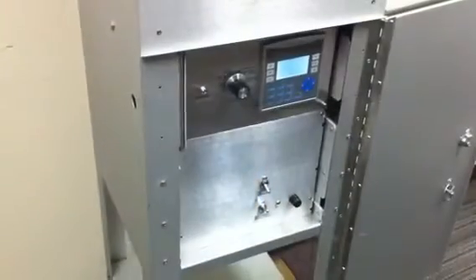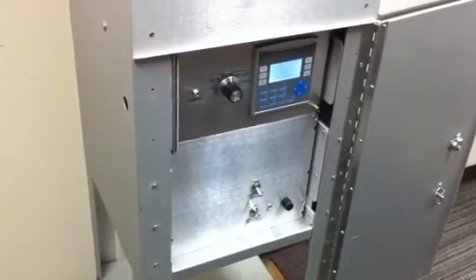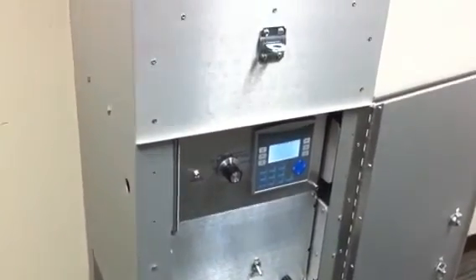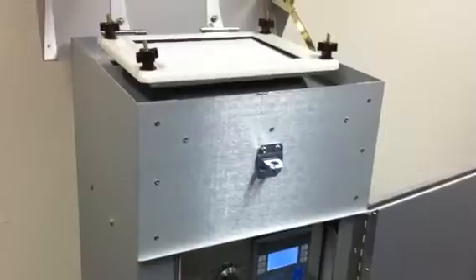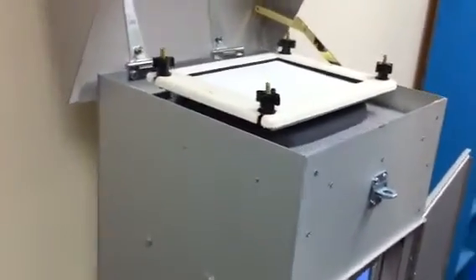One of the optional features of this unit is the filter shield, or the sample saver — a feature that automatically covers the filter paper when the unit is not in use and automatically opens just before sampling. It's controlled by a switch on the front panel.